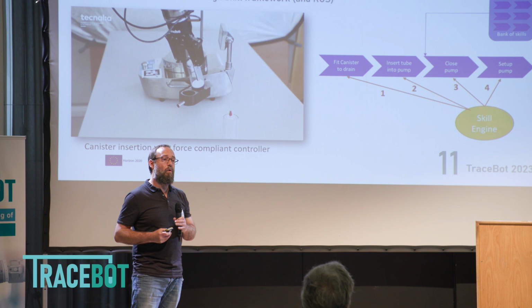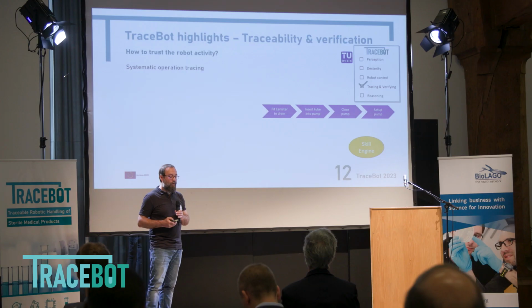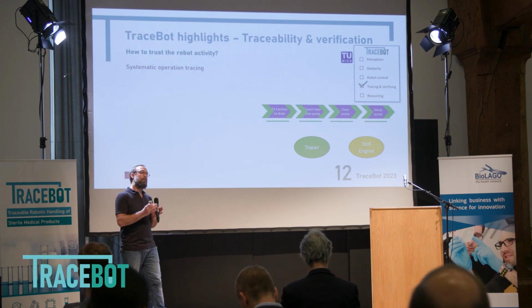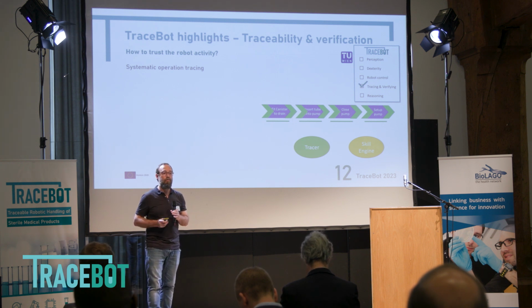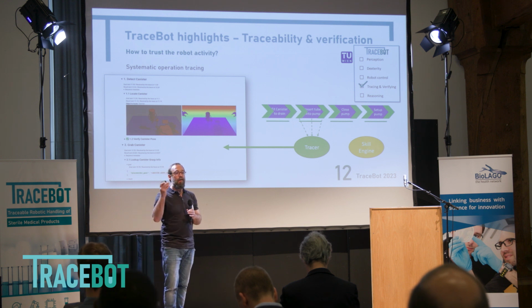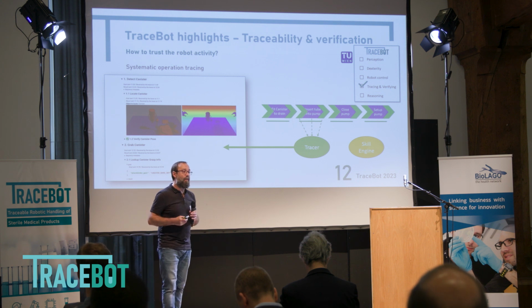The interesting part of this framework is that, as all the different behaviors are launched the same way, you can incorporate more constraints onto your system. You can incorporate systematic operations to be done at every time. And that's what we are using for the tracing. Aside from the skill engine, we incorporate a tracer that will automatically collect, from the different skills, information about the starting condition of the skill, the exit condition, and also feedback during the execution of the process. All this is collected automatically and then gathered to generate an audit trail that characterizes the succession of operations and the evolution of the activity conducted by the robot, so that we automatically get a trace of the activity that took place.